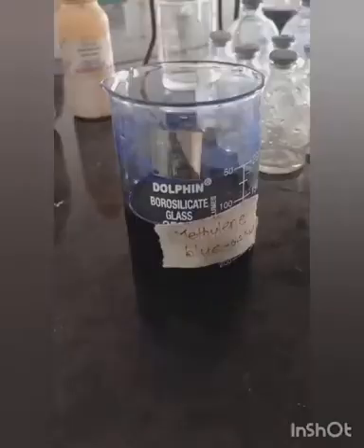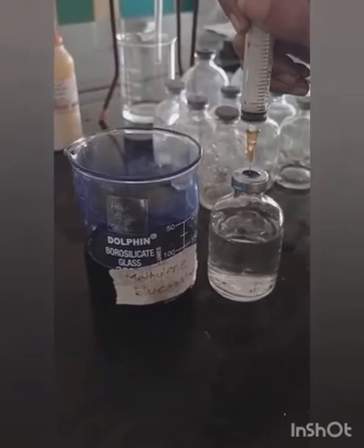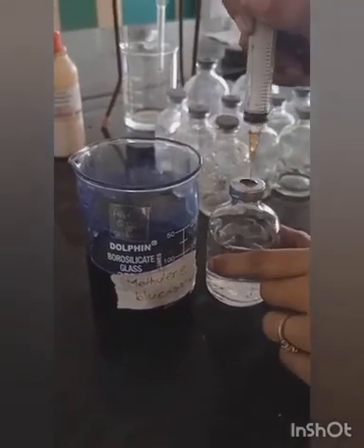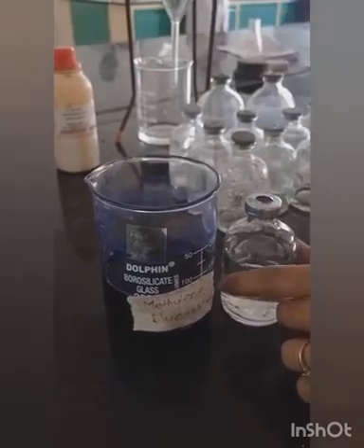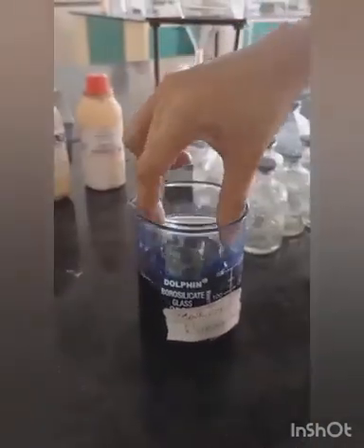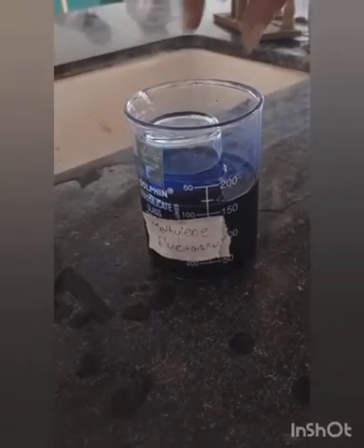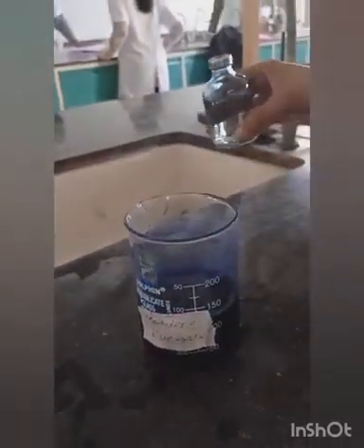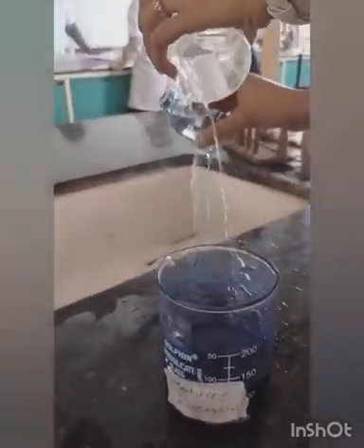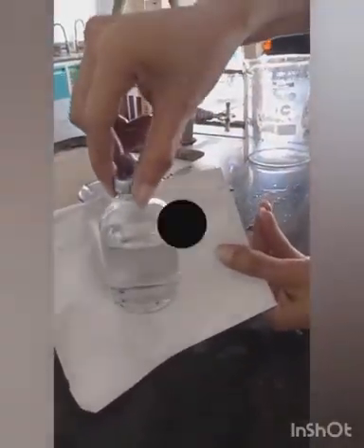The next test is the self-sealability test. Close the vial with the prepared closures. For each closure, use a new hypodermic needle with external diameter 0.8 mm and pierce the closure 10 times at different sites. Submerge the vial upright in a 0.1% w/v solution of Methylene Blue for 10 minutes. After 10 minutes, remove the vial from the solution and rinse the outside of the vial with water. Check that none of the vials contain any trace amount of colour solution.